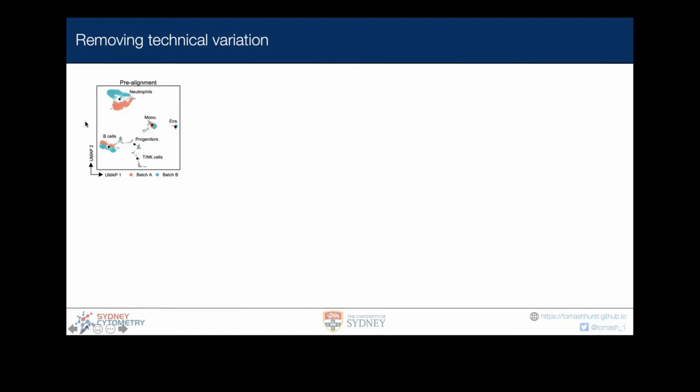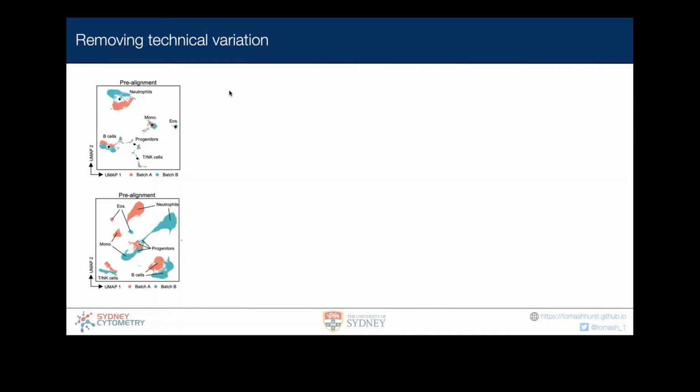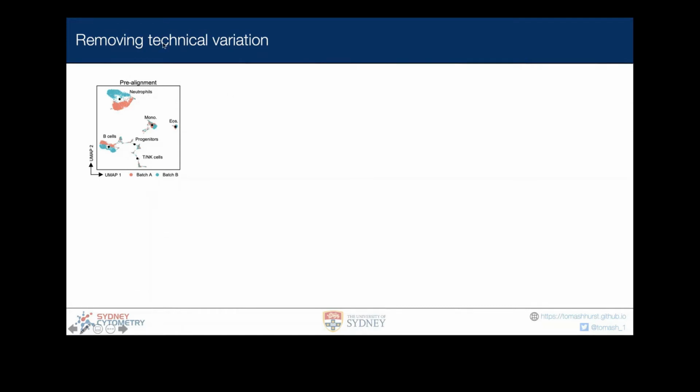So what that means is that on a plot like a UMAP plot or a t-SNE plot, cells that are nominally, in this case, neutrophils up the top, will split, and they will have batches sitting in different places. Now, if we cluster this data, what we might end up with is neutrophils from batch A in cluster 1, neutrophils from batch B in cluster 2. And so what we end up doing is splitting them into separate populations. And if we quantify that, then what we're actually doing is measuring difference between batches, not experimental groups. And this is something that we don't want to do.